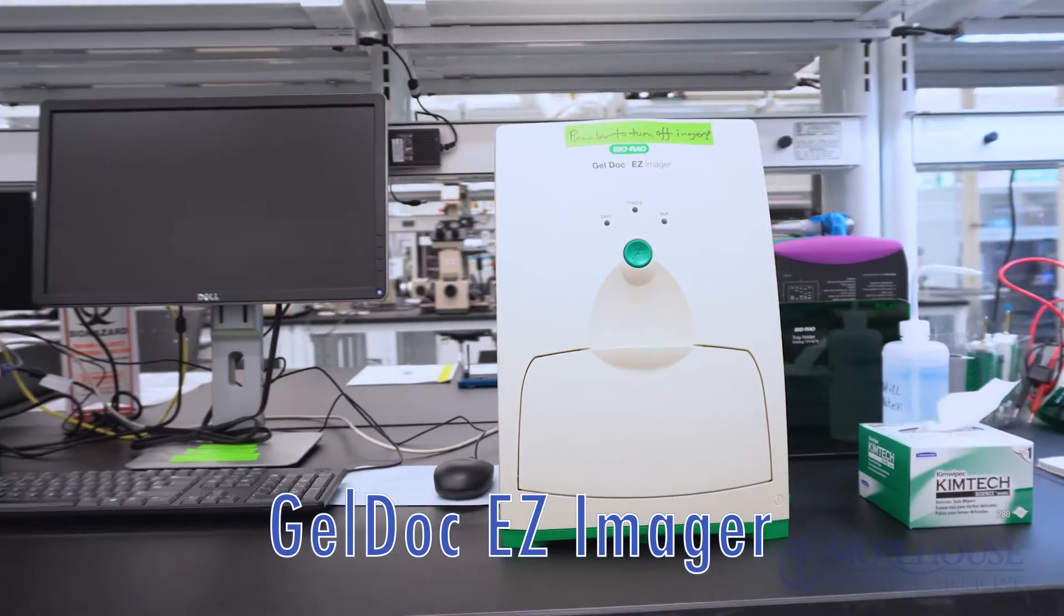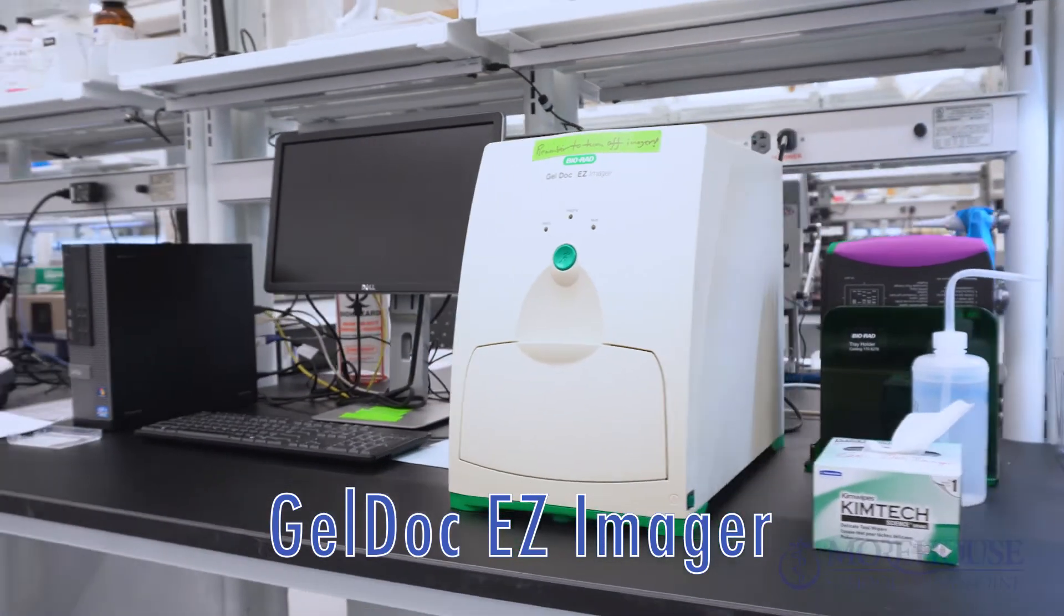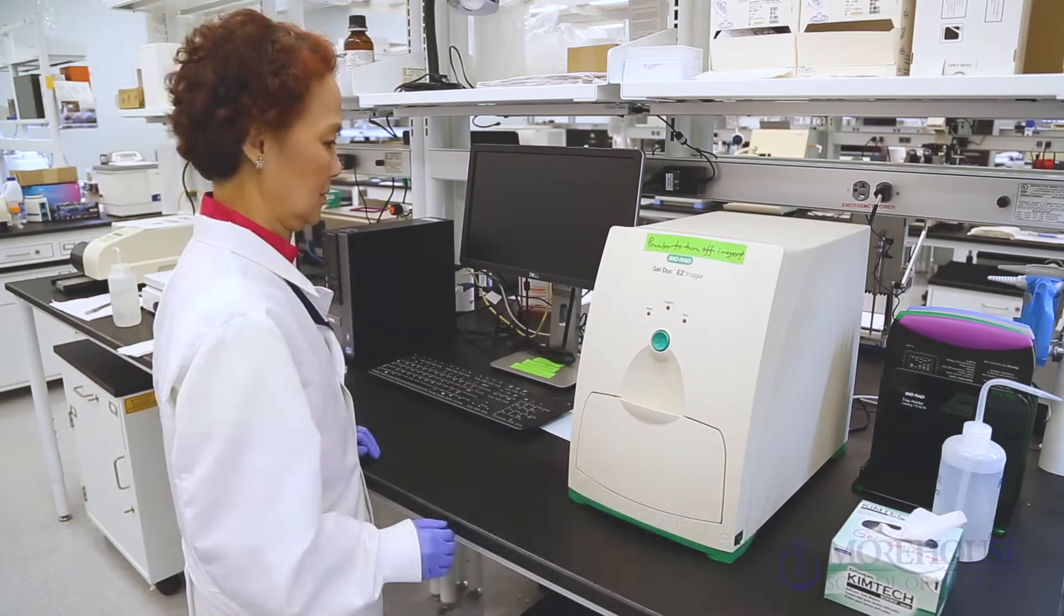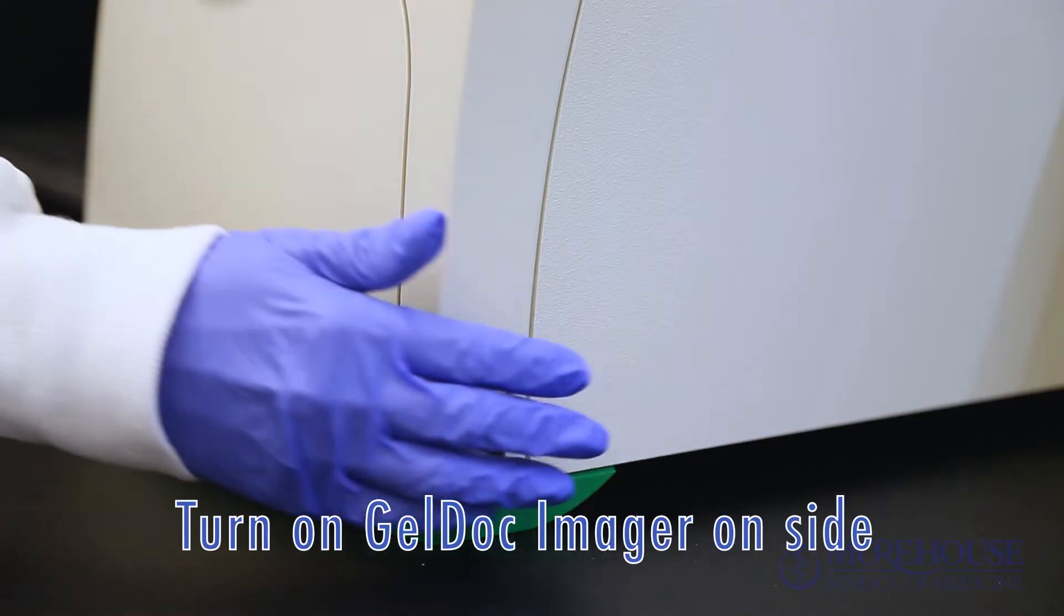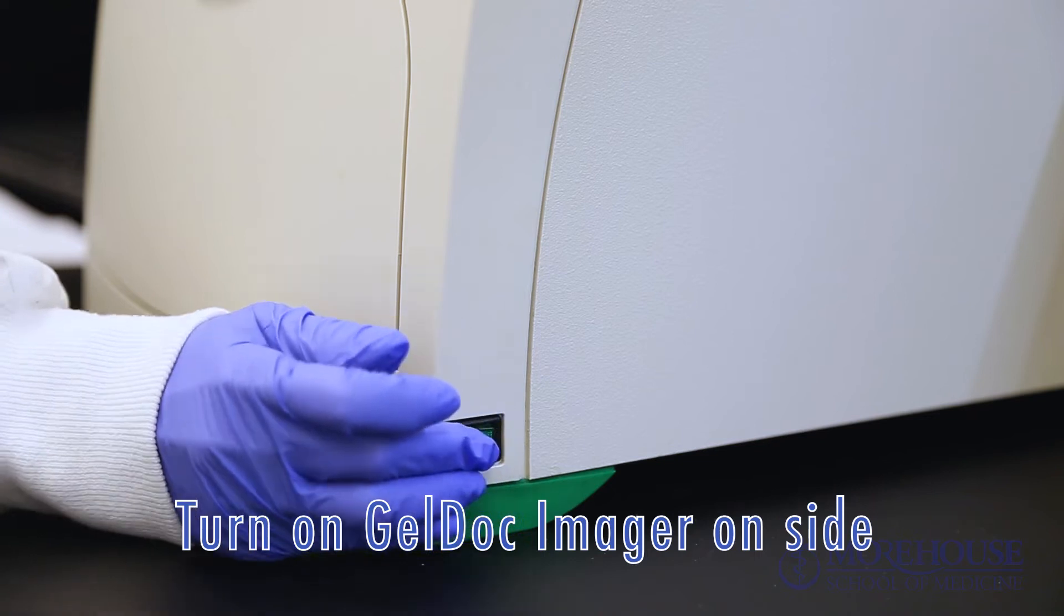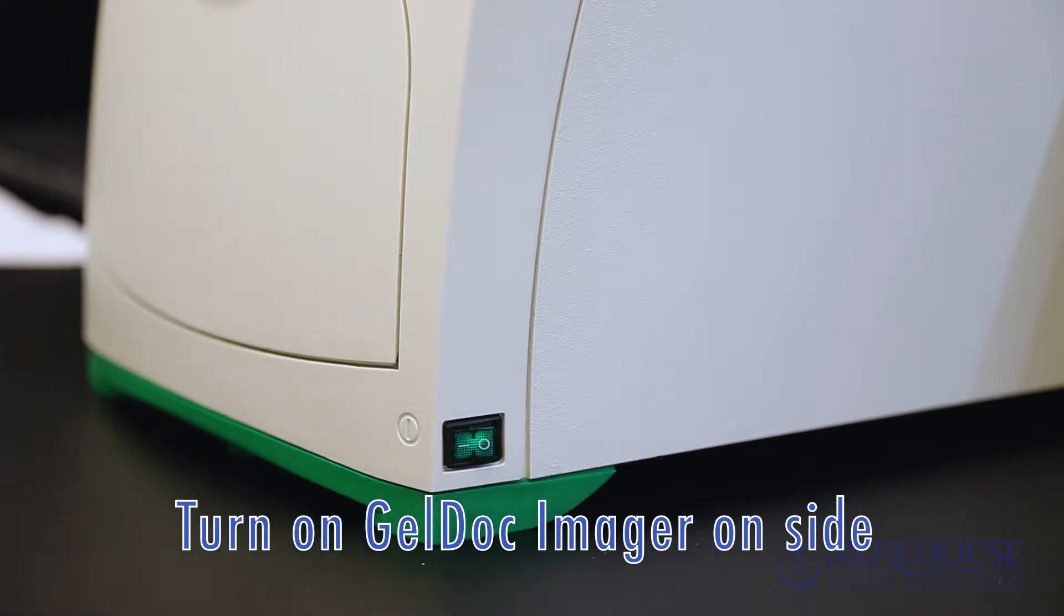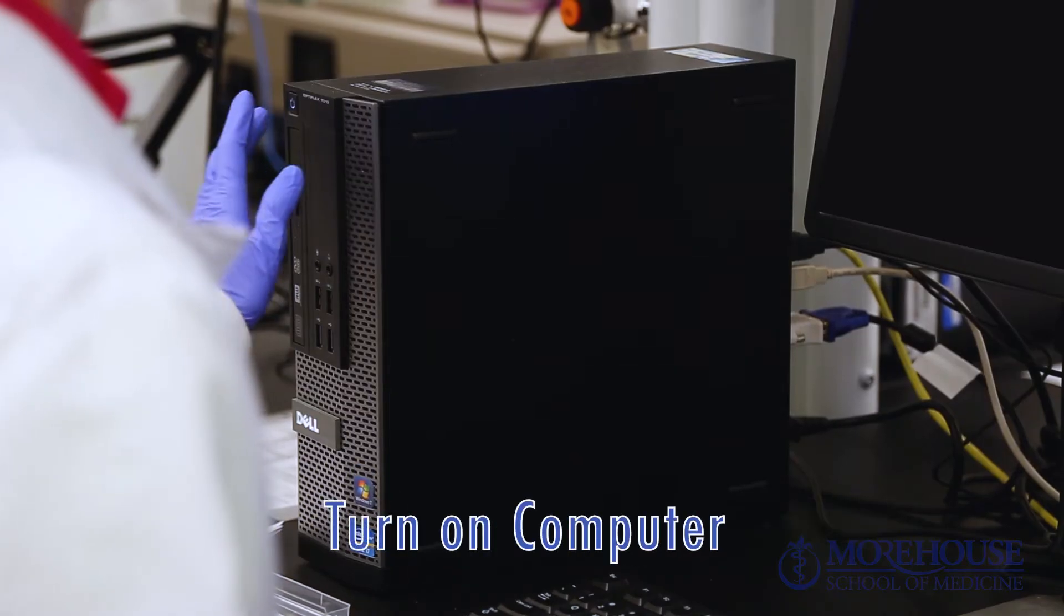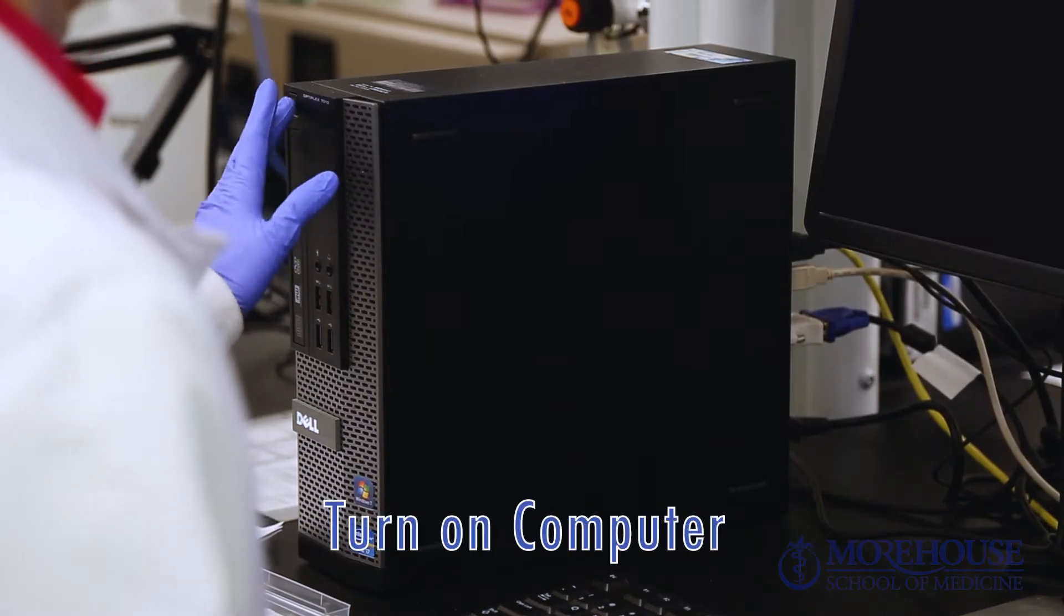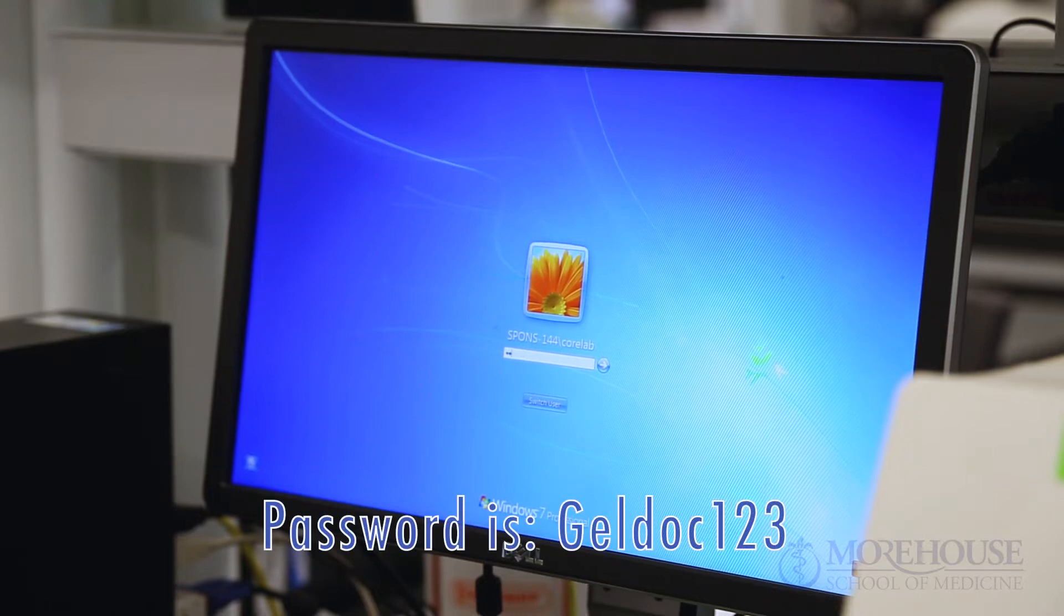GELDOC Easy Imager. Turn on GELDOC Imager on side. Turn on computer. Password is GELDOC123.